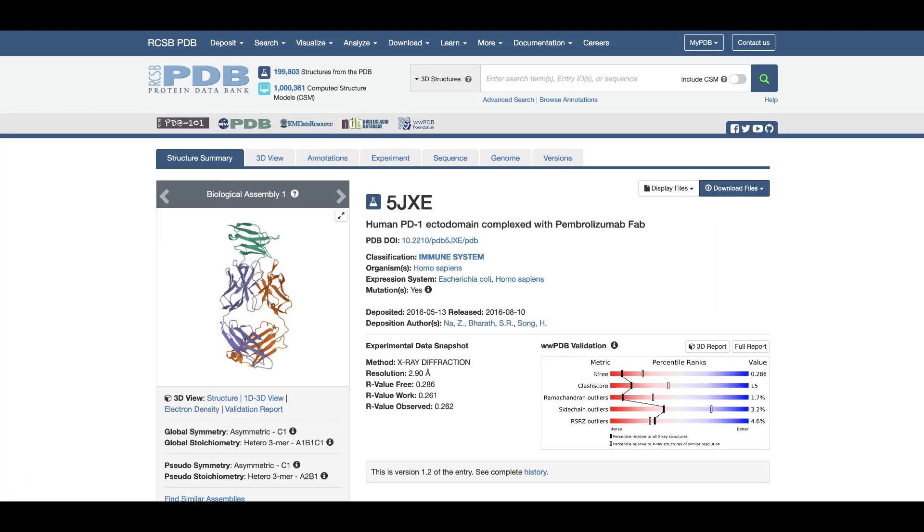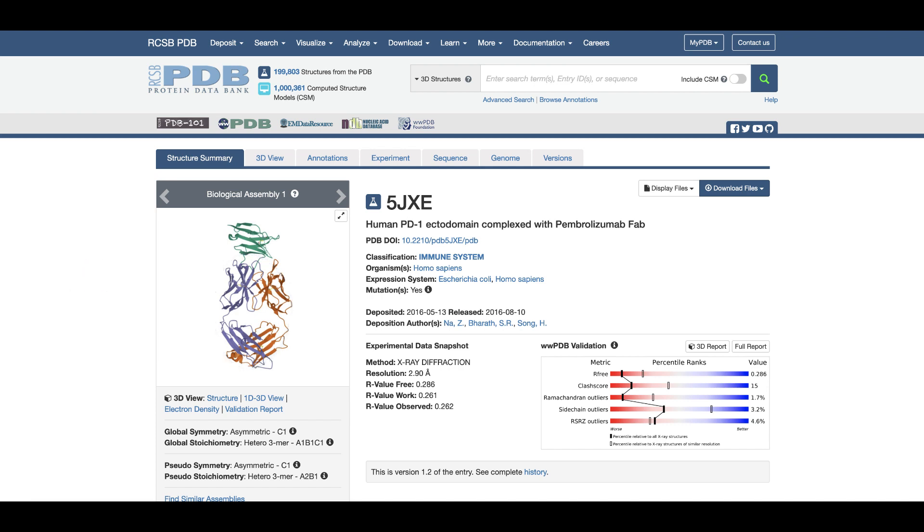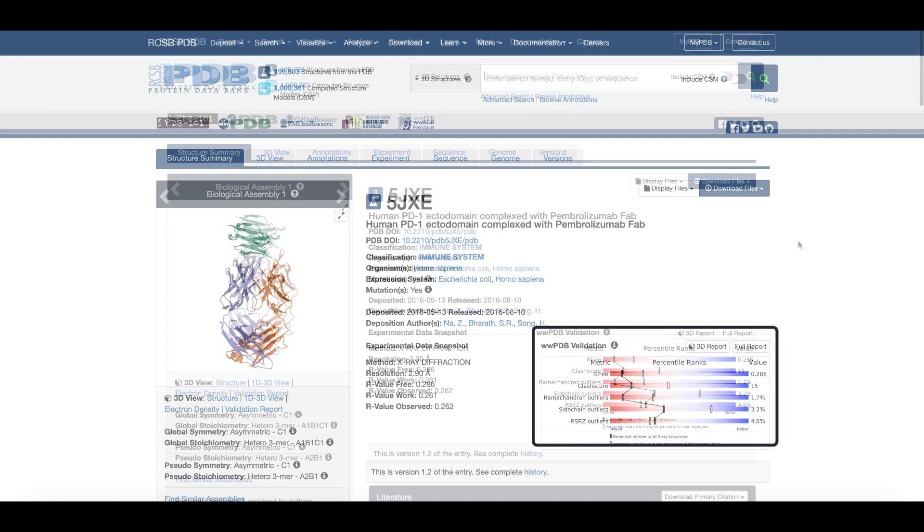The structure summary page for PDB ID 5JXE shows a snapshot of the extracellular domain of PD-1 bound to the antigen binding fragment or Fab region of the pembrolizumab antibody. Besides listing the structure title and author names, this header section shows a validation slider providing an assessment of structure quality.